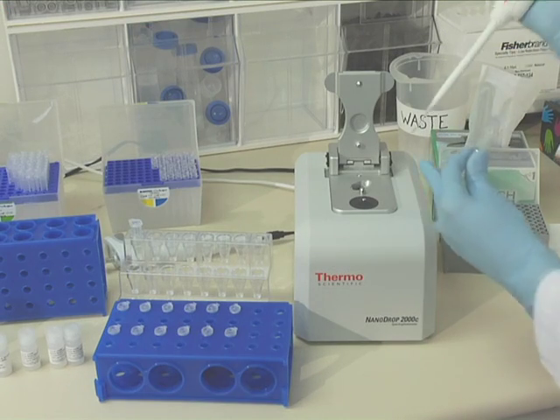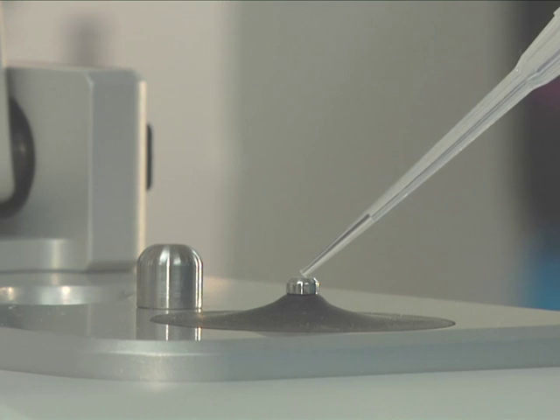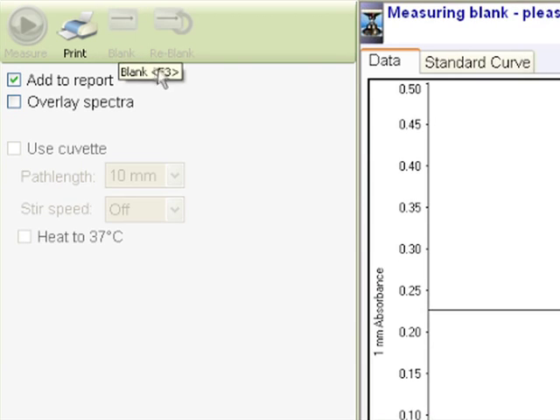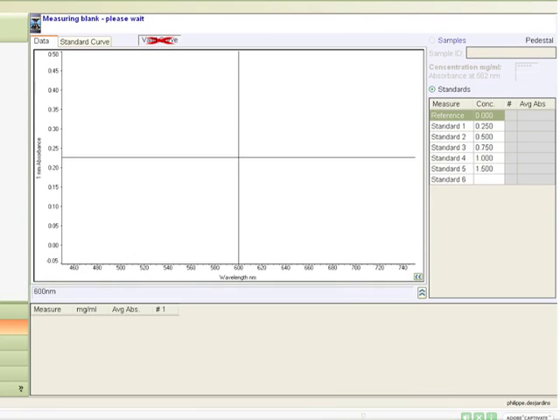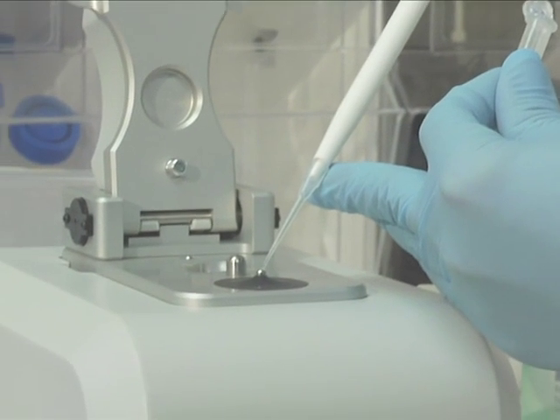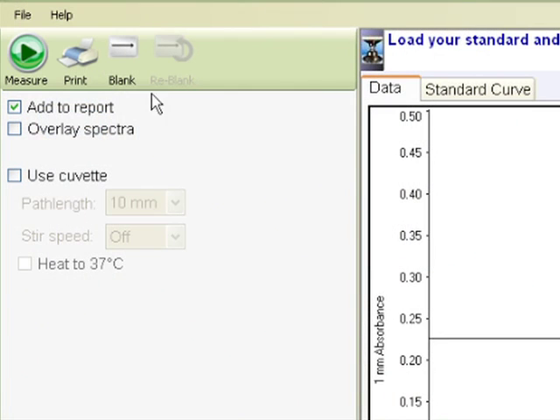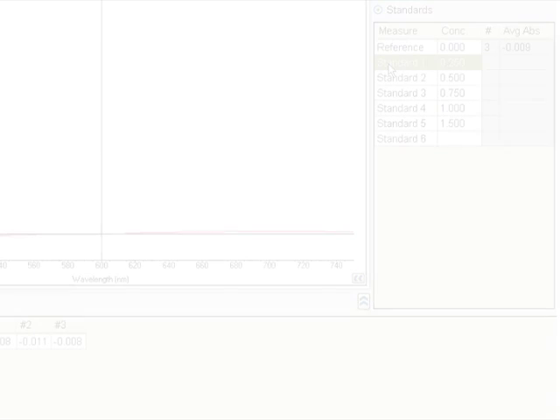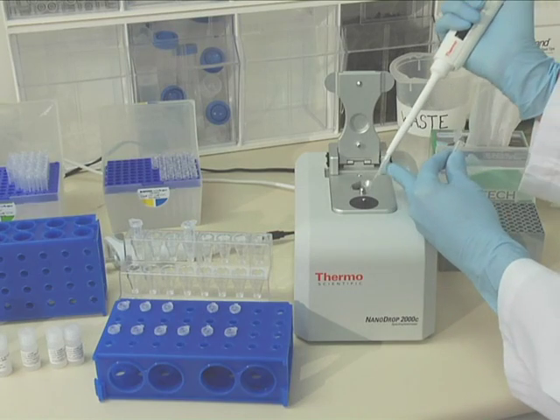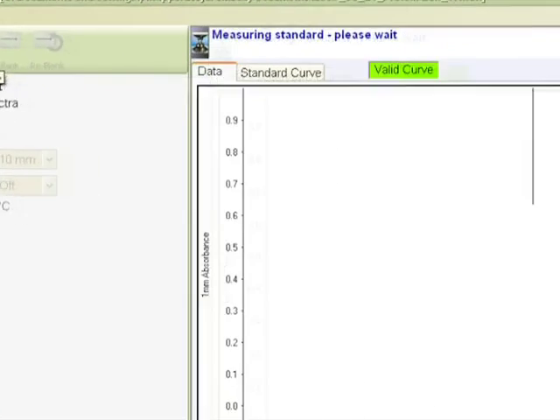Establish a blank using the appropriate buffer. The blank for colorimetric assays is generally deionized water. Pipet 2 µL of water onto the bottom pedestal, lower the arm, and click blank. Only one blank is necessary to cover all subsequent measurements of the reference and standards. Establish the reference by pipetting a 2 µL aliquot of only working reagent and buffer with no protein onto the lower pedestal. Lower the arm and click measure. Under the standards tab, highlight the desired standard, pipet 2 µL onto the lower pedestal, lower the arm, and click measure. Repeat the process for all standards.